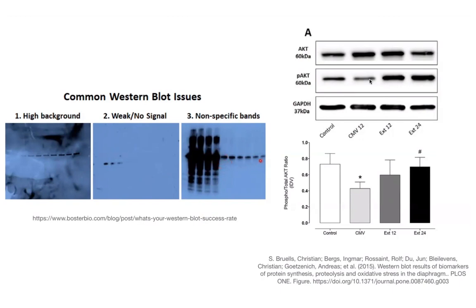And so often you have to have a bunch of controls in order to show that your antibody really is recognizing the thing that you want. And although you can get away with showing just these strips in the paper, often in the supplemental or extended data, they'll make you show your actual raw gels with all of their different beautiful Western blots.